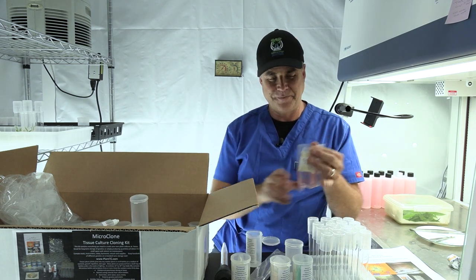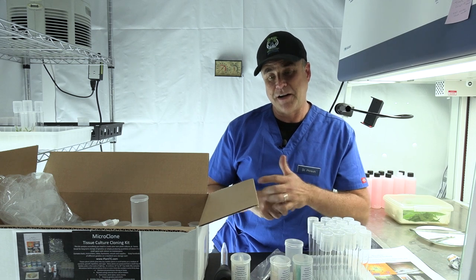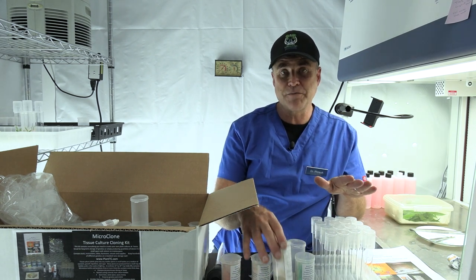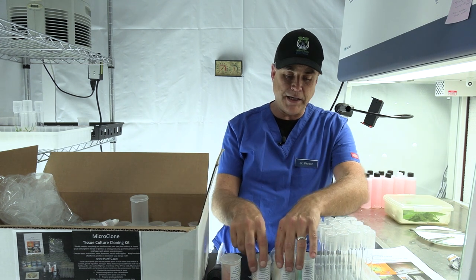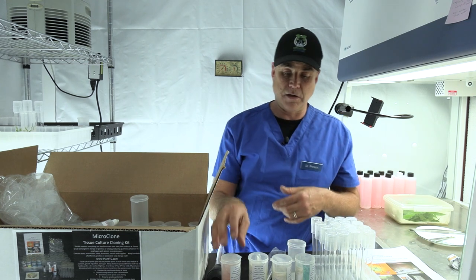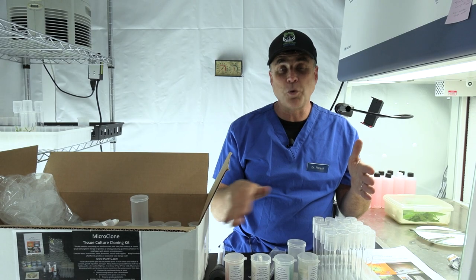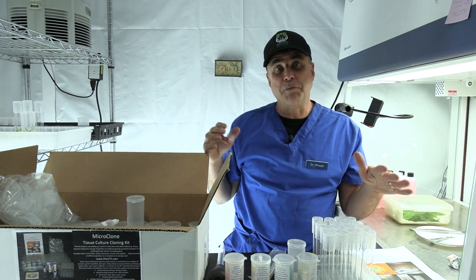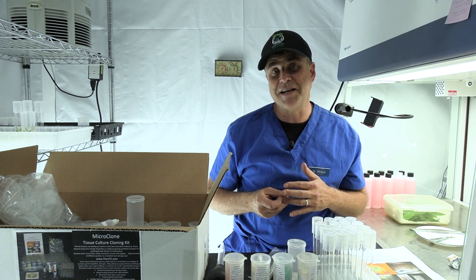The instructions are right there on the bottle. I have four different media — they're color-coordinated. Red is for rooting, which is my tissue-ponic shortcut primarily for cannabis. For everyone else, or for cannabis growers storing plants for a longer period, we do that in one of the multiplication media. The difference is these have the branching hormones and these have the rooting hormones. I've got three different recipes because the kit is sold for a variety of plants. Each bottle will make 100 tubes or 50 flip tops, which is 100 plants — so one bottle of concentrate equals 100 plants at just under 10 cents per plant.